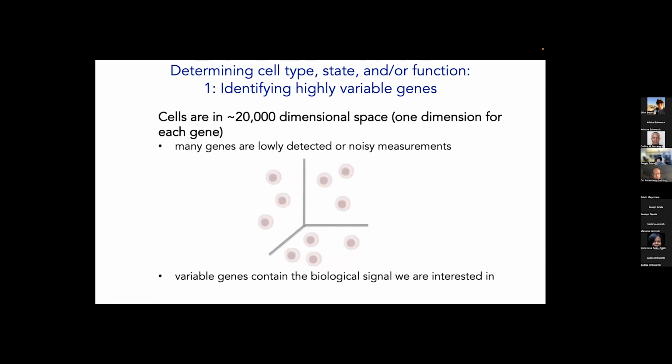Okay, so to start, our data exists in very high dimensional space. So 20,000 dimensional space, one dimension for every single gene. Normally we think in 2 or 3 dimensions, like if we're following a map, like Google Maps, that's 2 dimensions. If we're walking around, we're in 3 dimensions. So 20,000 dimensions is very hard for people to reason in because it's just outside our normal experience.